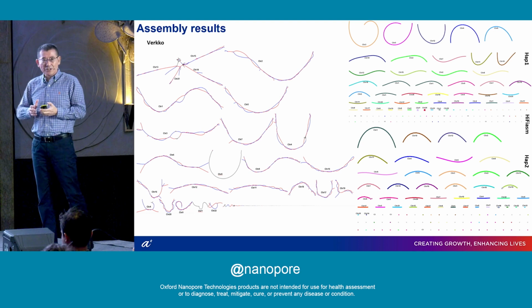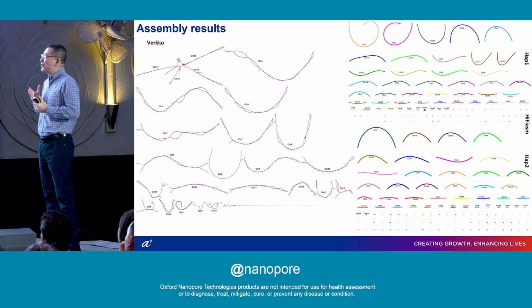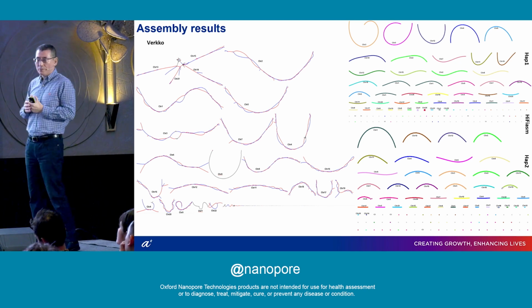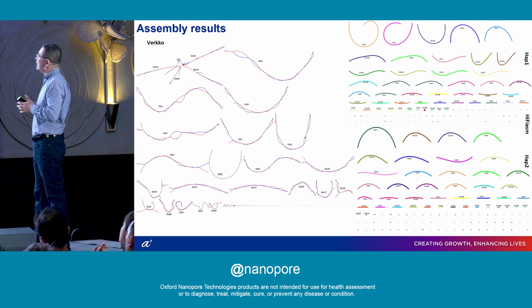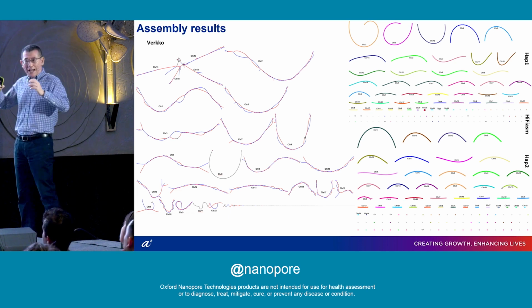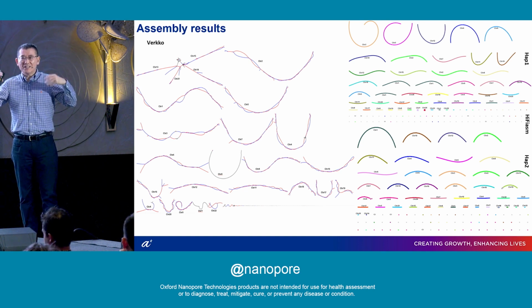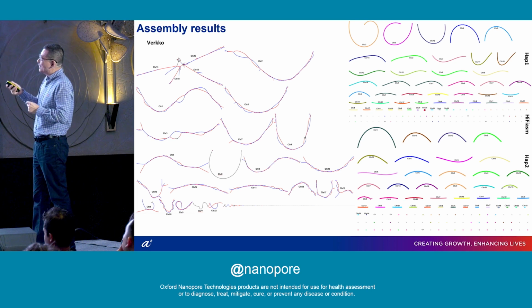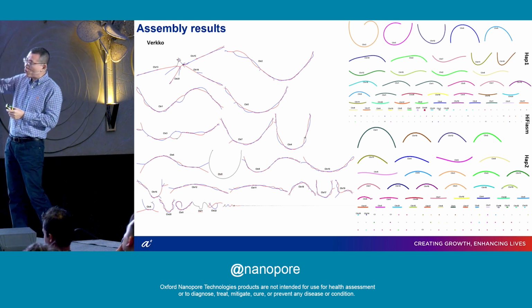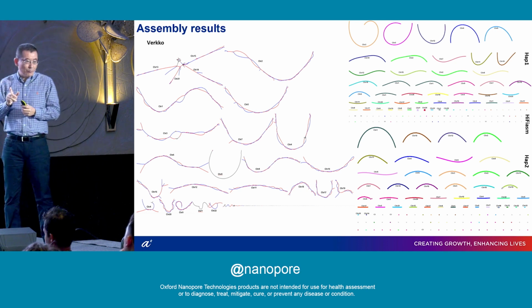This is a visual presentation of the contigs or scaffolds generated from these two algorithms. On the left side is Verkko, on the right side hifiasm. You can see that for Verkko, they try to assemble the whole chromosome out as much as possible. We call this scaffolding. They have scaffolded a step inside, right? And of course, you can see that 4 chromosomes are tangled together. They are chromosomes 13, 14, 15, and 21.